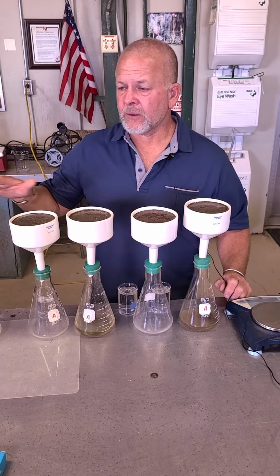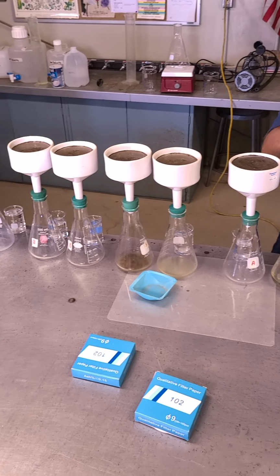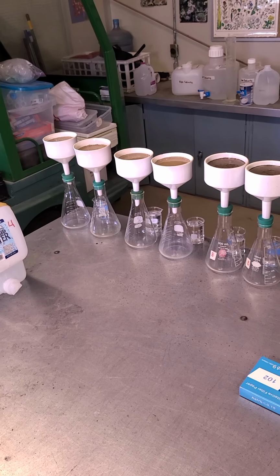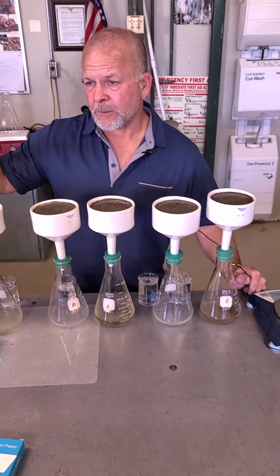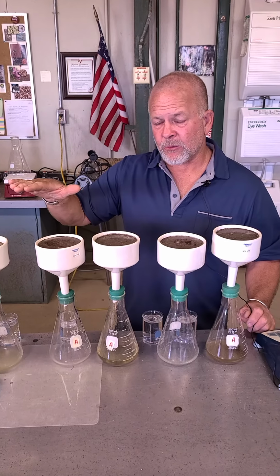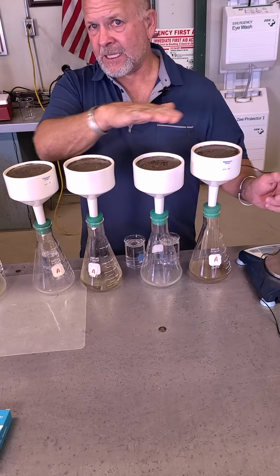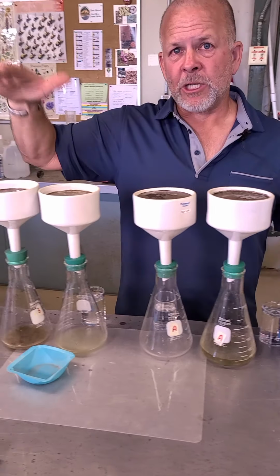So we've gone ahead and filled all these things up. To review, we have 50 grams of soil in each one. We added 100 mils of the treatment, and then on top of that we added 100 mils of the deionized water on top of each one of these treatments. And then after that, as it began to flow through, we maintained the head. And you can kind of see the water level is at the same height in all of these. So the same amount of pressure is pushing down on each sample.